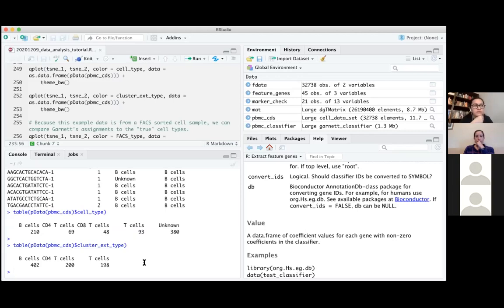Okay, if the data set is very large, is 500 always enough, or do we need to do a regression type of analysis to find which number of unknowns is perfect to use? Yeah, that's a good question. If it's very large, start with 500, and then you can decide if that's giving you fairly believable results, and then decide if you want to increase that number or not. It totally depends on how large it is. But I would say don't go below 500 for non-dummy data sets. Thank you.